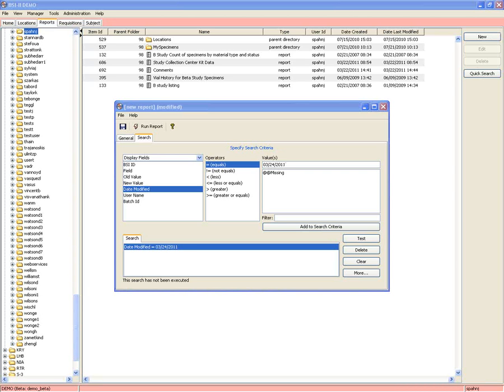The subjects which are added to subject attributes, will they be linked with inventory reports? Yes. So if you're not familiar with the subject module, if you have study level security and you have the subject module added to your database, and if you don't, it's just a quick RFE to add some database tables and then it'll show up. You can add subjects through subject to begin with, or you can add subjects through adding specimen data. So every time you add a specimen record, we add a record for that subject ID to the subject table. And you can search on subject attributes to pick inventory, to pick specimens, and let me show you.